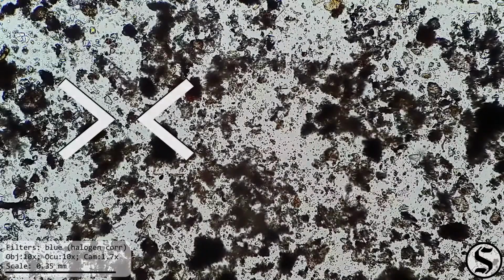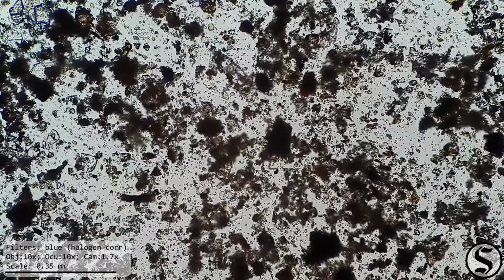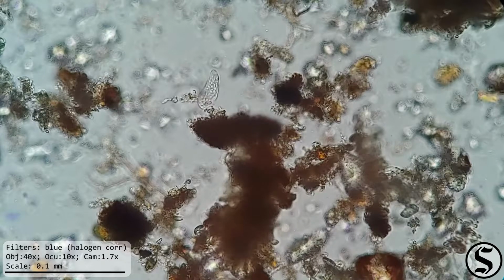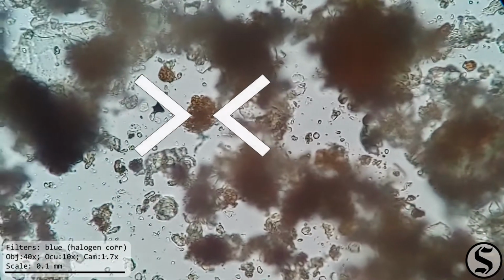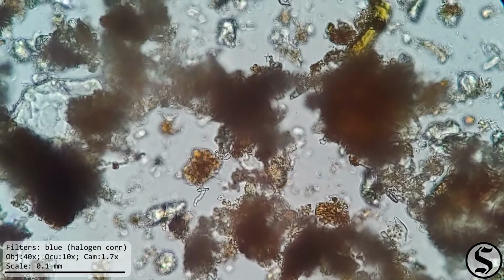Well, right off, looking at some of the sediment, we can see some movement over there. Some kind of small microbe noodling its way around. At a higher magnification, we can tell that this is a ciliate. Cilia, remember, is Latin for eyelash. And over here we've got another very small ciliate moving around the sediments, probably looking for things to eat.